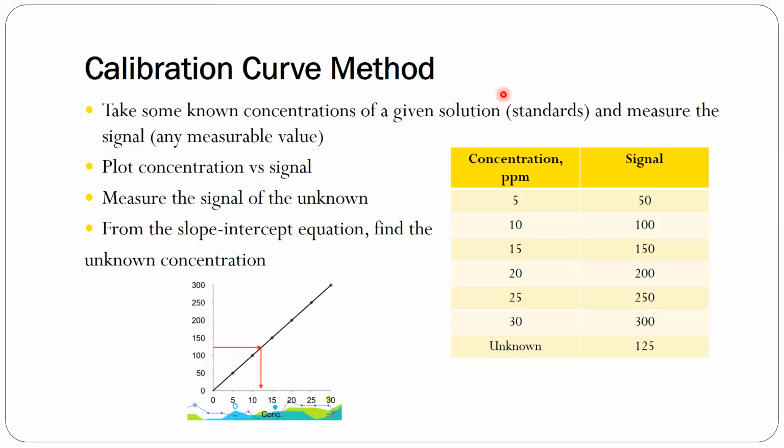Now let's go to your application or analysis. Paano natin gagamitin yung Beer's law principle, yung spectrophotometry in the determination of unknown samples? So I will discuss two methods for this application. The first one being the calibration curve method, and the second is yung tinatawag nating standard addition method. Okay, so let's start with this calibration curve method.